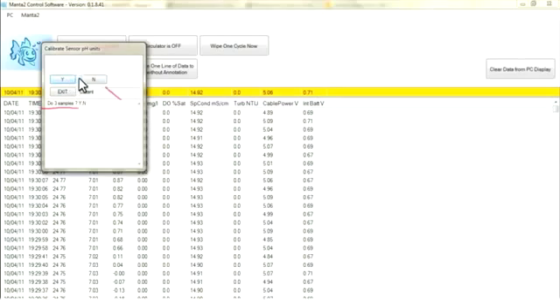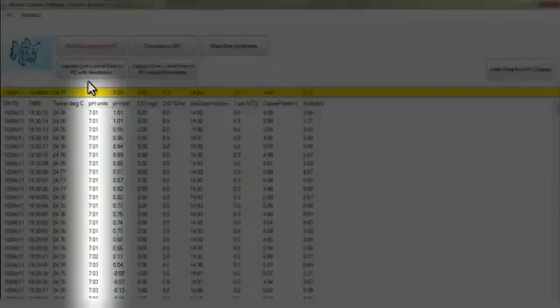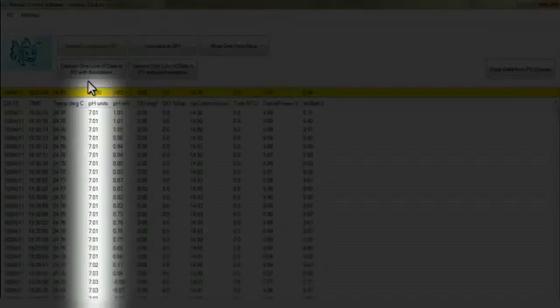Do I want to do three samples? No. Calibration successful. It goes to the screen. It's displaying ten.